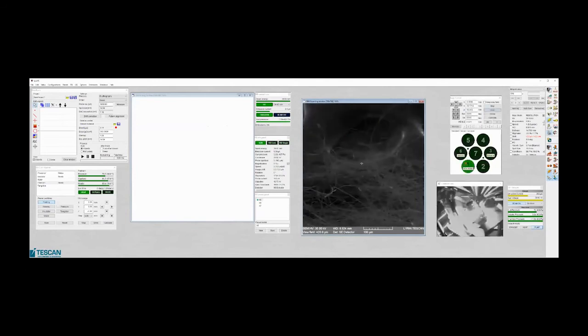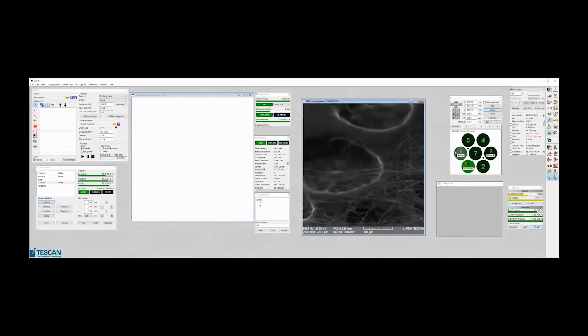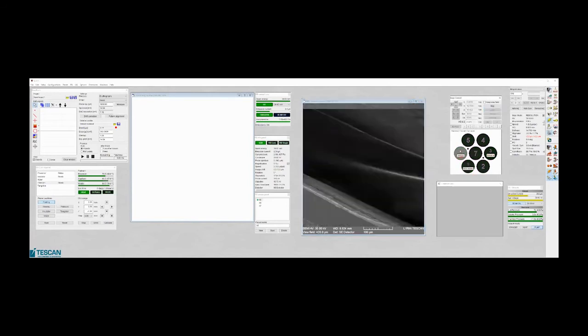Okay, so here we are. So this deposition process, I will show it to you on this neurons sample.